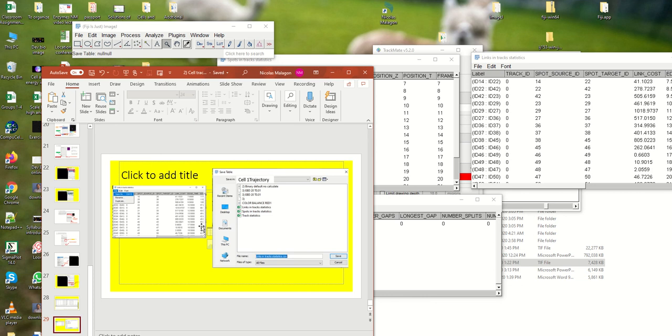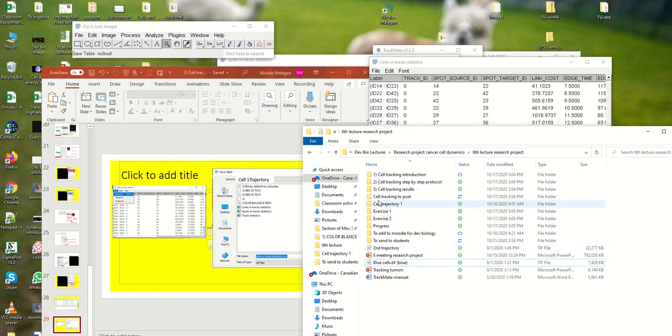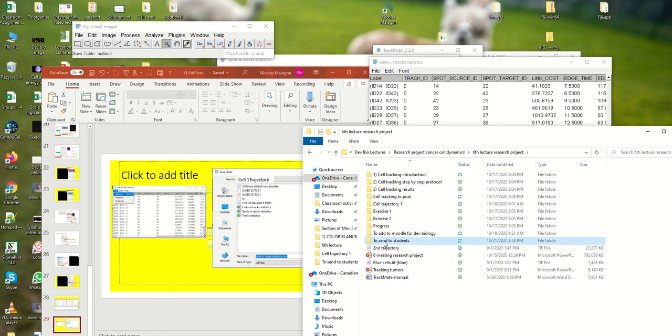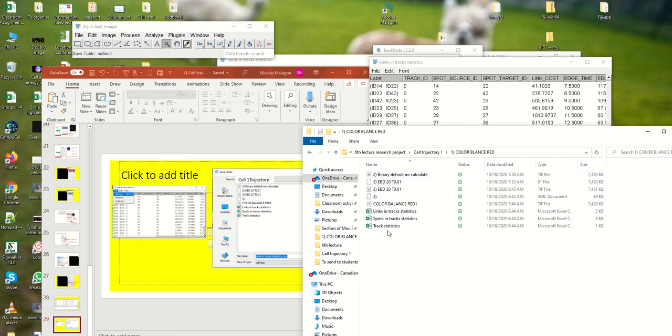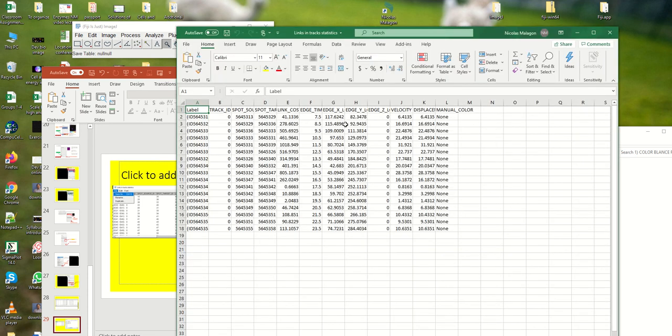So then with these things you can go to Excel, and this is the file that I just showed you. And when you have that file, for example, you can play here with the velocity, and you can see what is the velocity of the point.